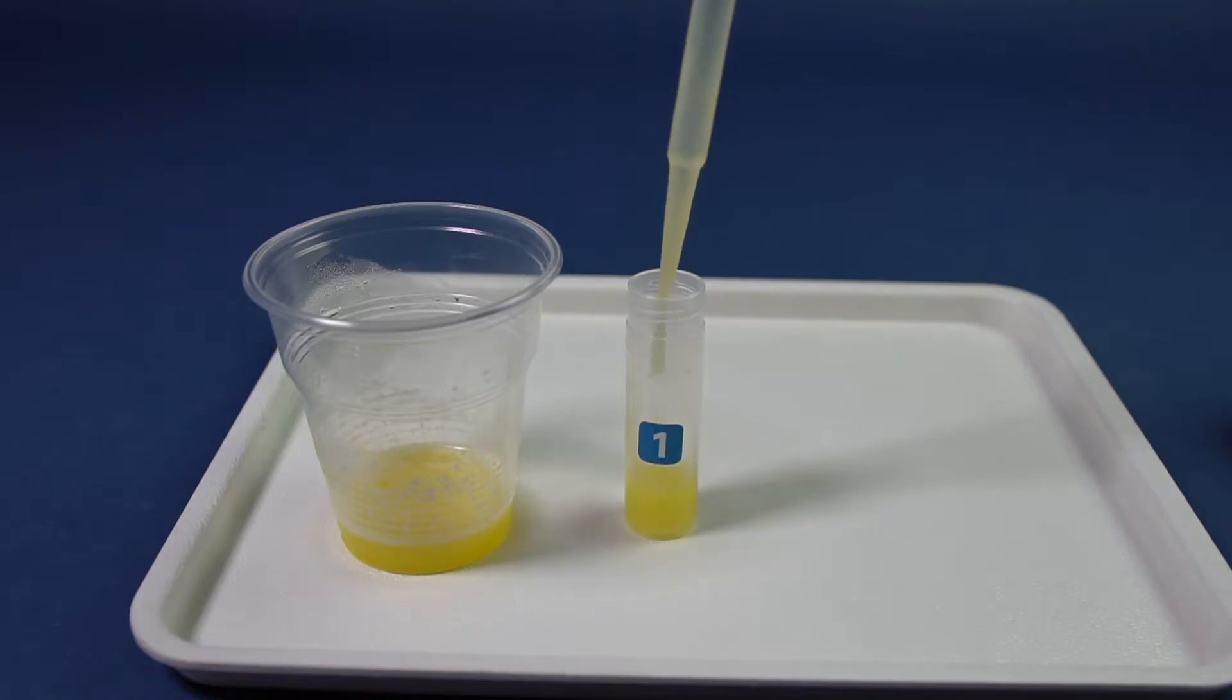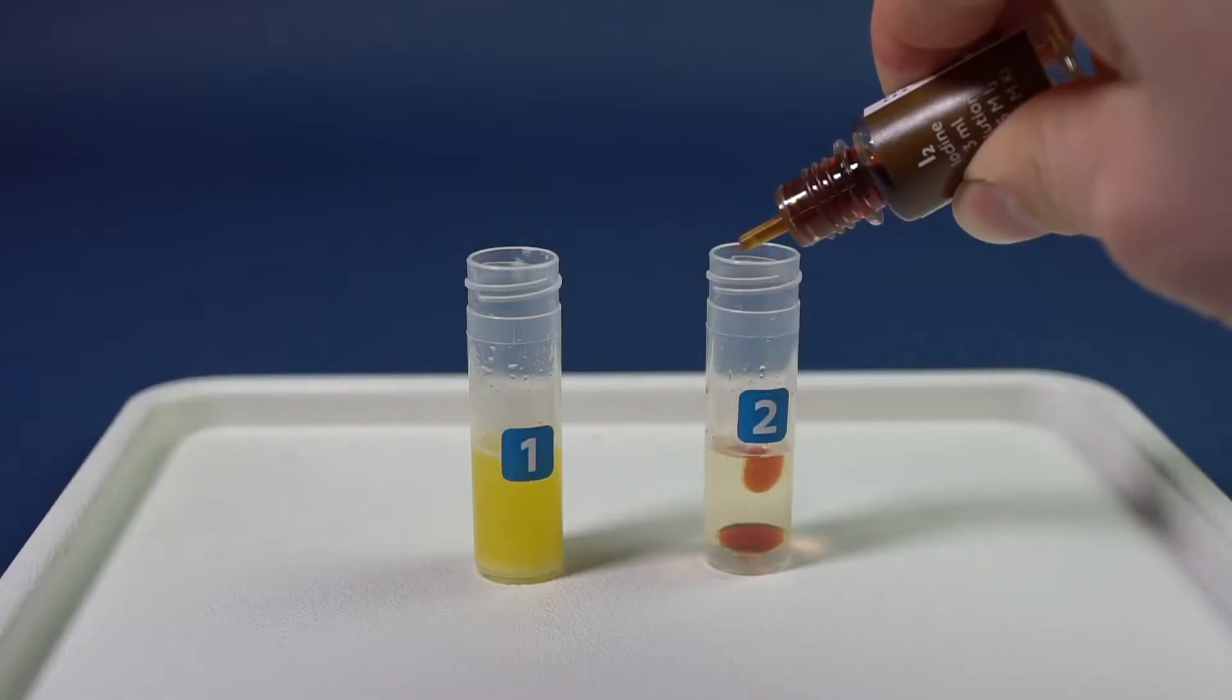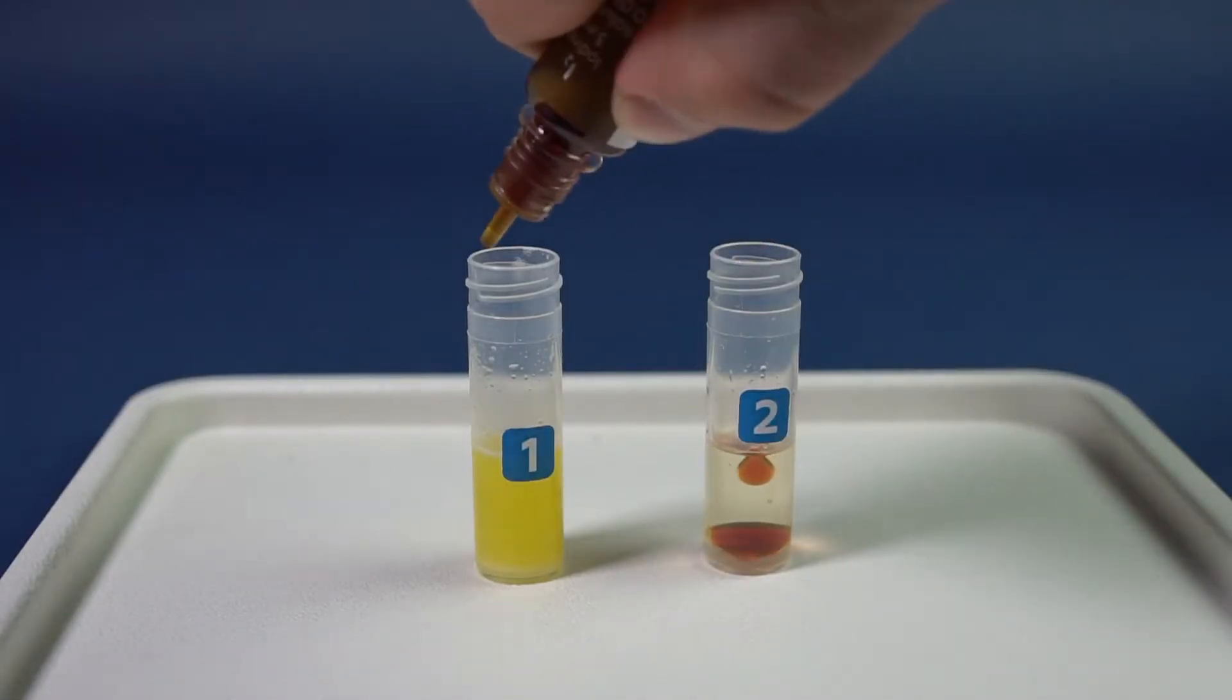Then take two vials and fill them with the fats to the half. Add one drop of iodine into each vial and heat the vials in the water bath.